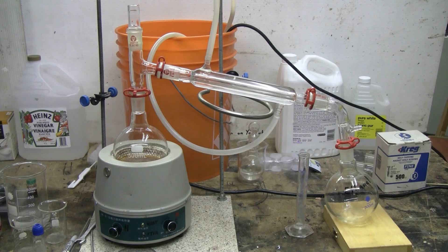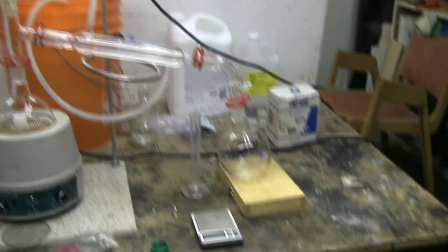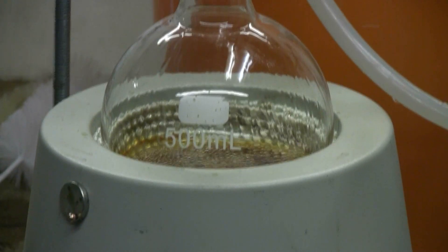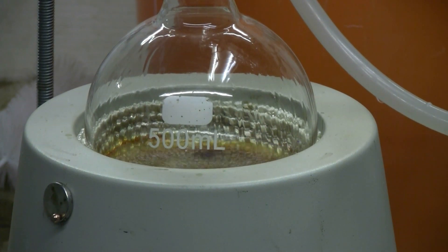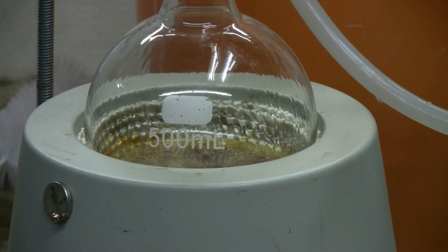I've set up for simple distillation and I'm now recovering the majority of my ethanol from the extract and getting it back into a 500 milliliter collection flask. I'll leave about 20 or 30 milliliters in the boiling flask just so that the extract remains liquid enough for me to pour it out. I'll pick up the video at that point.